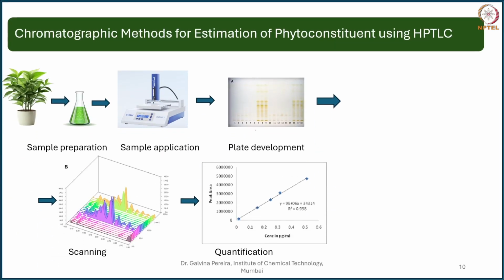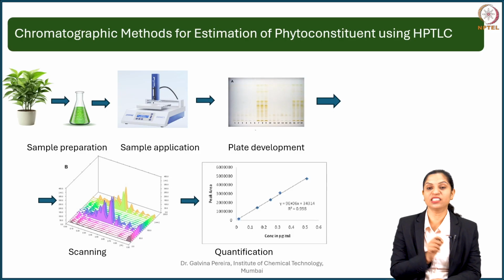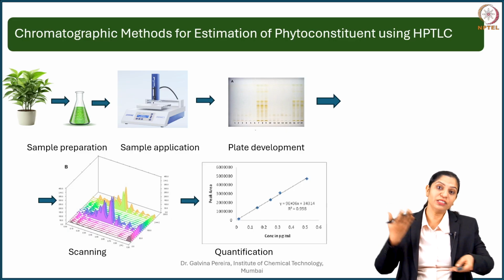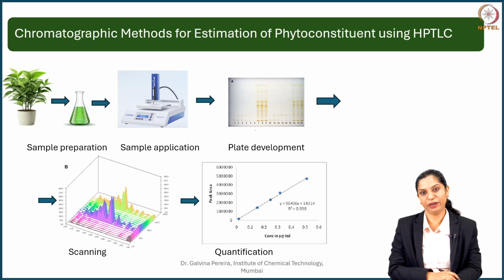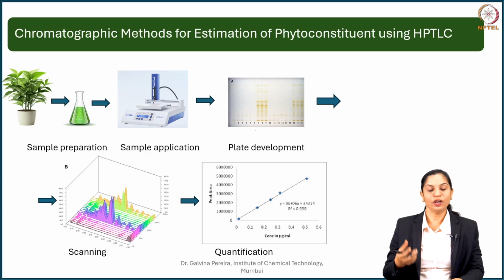The next one is when we do a specific analysis. Now this specific analysis means I am analyzing one compound at a time. So when you are doing this, you require chromatography for separation of compounds, which we didn't do in the previous method, and as a result this is classified as a specific method. So you are going to take your adulsa leaf, convert it into a fine pulverized powder and then macerate. Okay, you can macerate in your hydrochloric acid to convert it into salt, and then what we did, you remember this, you all extracted it with chloroform so that all the pigments are gone.